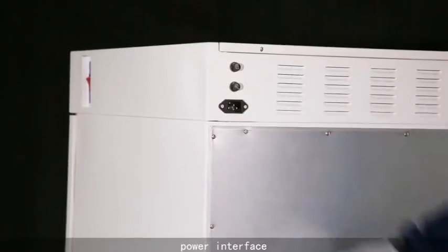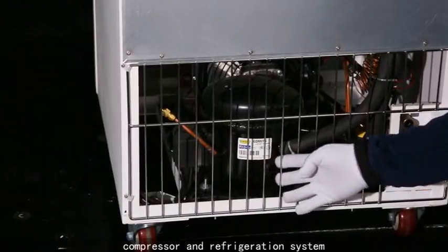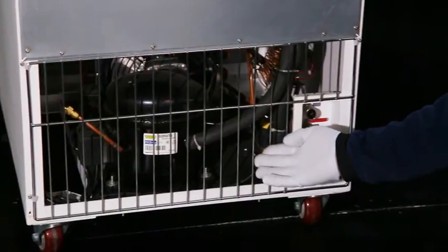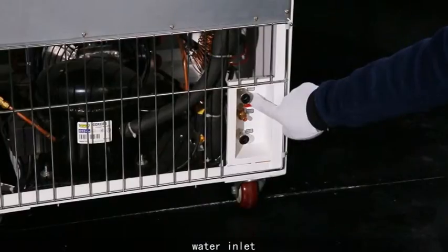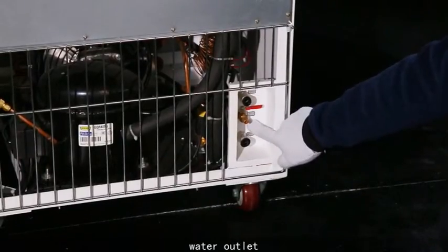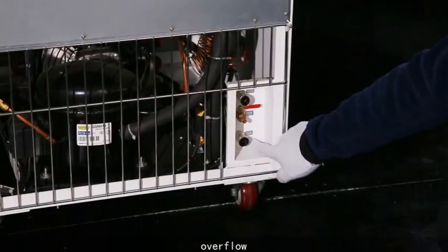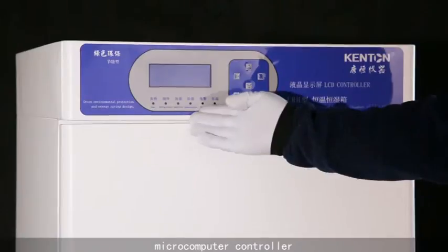The compressor and refrigeration system, water inlet, water outlet, overflow, and microcomputer controller.